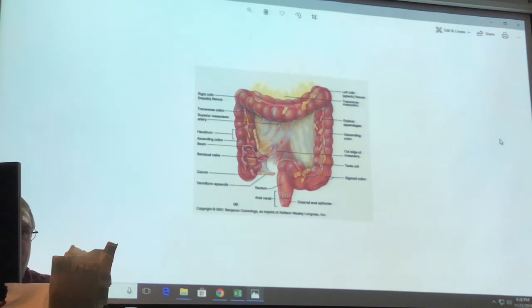Okay, so that's small intestine. That's an important one. That's a big one. We've reached the final section of the digestive tract. We'll try and move through this relatively quickly, so you know this is a long lecture. People are getting tired. We're almost there.